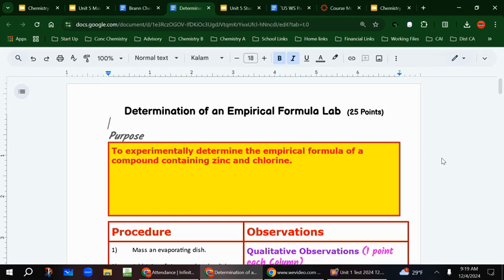There is a bottle of the concentrated acid. There is no reason in the world for you to pick this bottle up and handle it. Okay? No reason. Take the lid off, set it on the side. The lid is not on there tight. Do not try to pick it up by the lid. It will drop, it will break, and it will be a contamination problem. Hold down the bottom. The lid is just set on there loosely. Take it off and set it on the side.